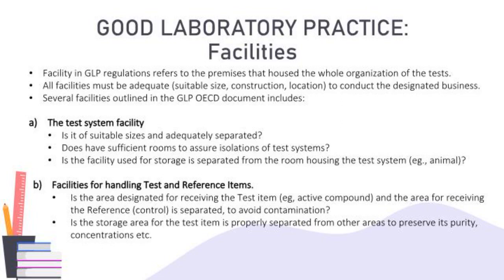Some of the facilities outlined in the GLP document are the test system facility. Is it of suitable sizes and adequately separated? Does it have enough rooms to ensure sufficient isolation of the systems? Is the facility used for storage separated from the room that houses the test systems? Is the area for handling the test item — our test compound — well separated from the handling area of the reference item — our control item — to avoid any risk of contamination? Is the storage area for the test item properly isolated from other areas in order to guarantee its purity and concentration?